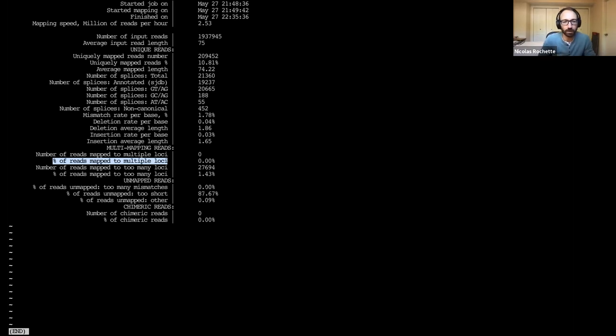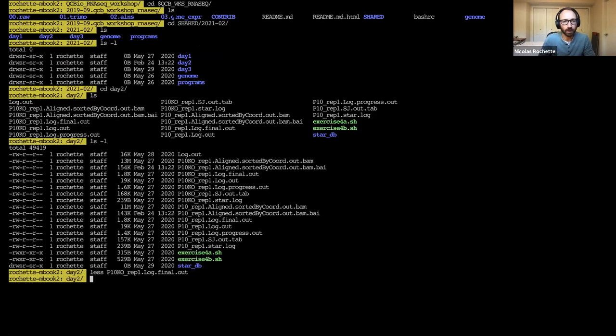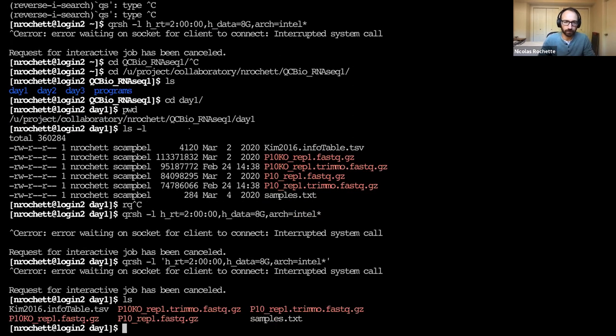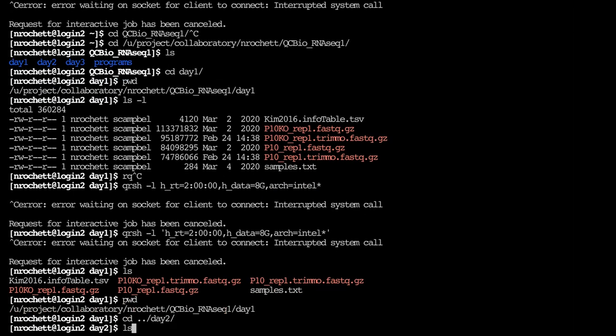I can pre-provide the output BAM files, if you want to try to open them in IGV. Let me just copy them. Yeah, I'm working on installing that browser right now.